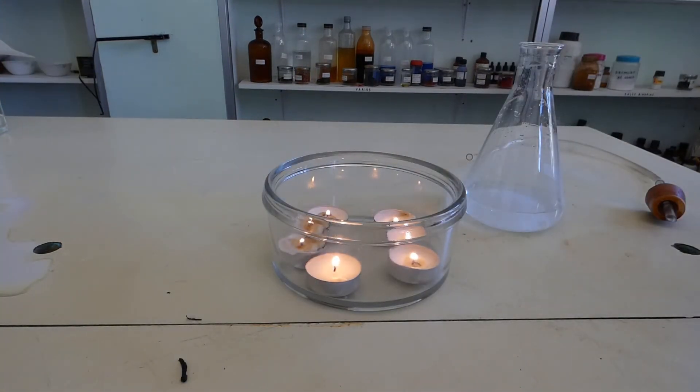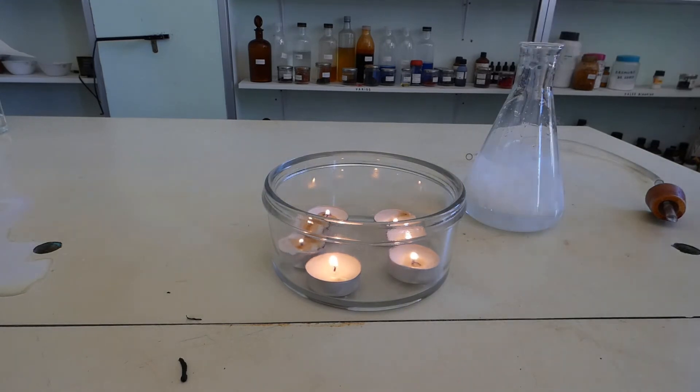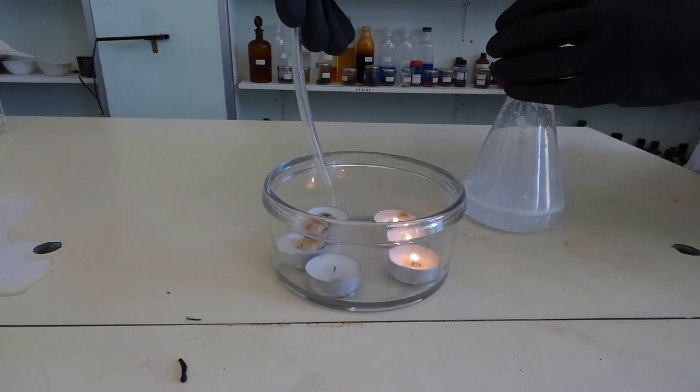Pour some acid into the Erlenmeyer flask and carbon dioxide will be released. Cover the Erlenmeyer flask with a stopper that has a rubber tube connected to it.